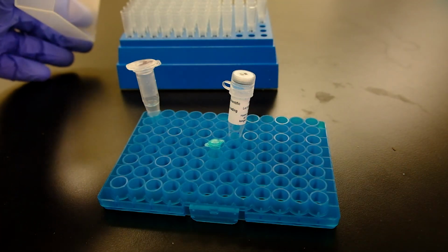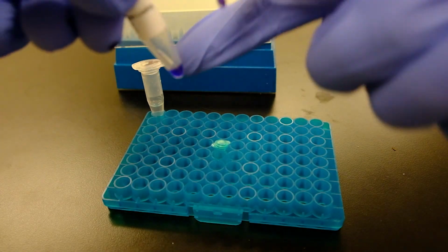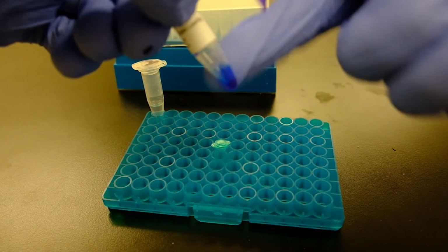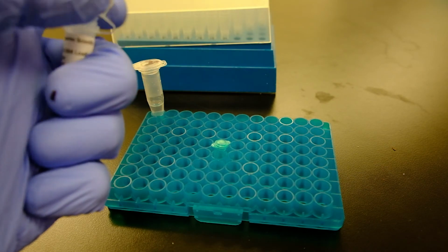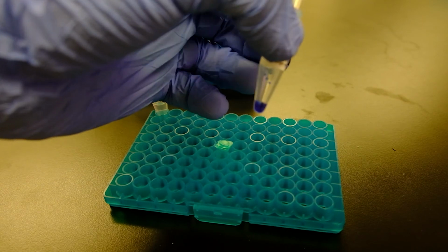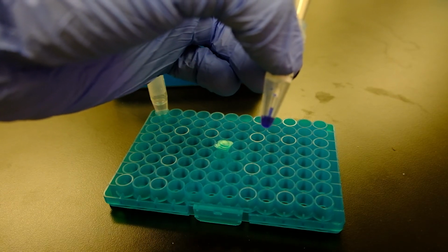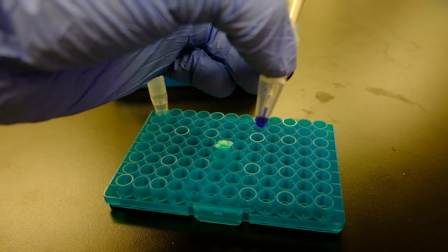Now, this particular dye is 6x, so for 25 microliters of my sample, I would need 5 microliters of the dye. This varies depending on the manufacturer and type of the dye. Draw the dye slowly, it has some viscosity to it.